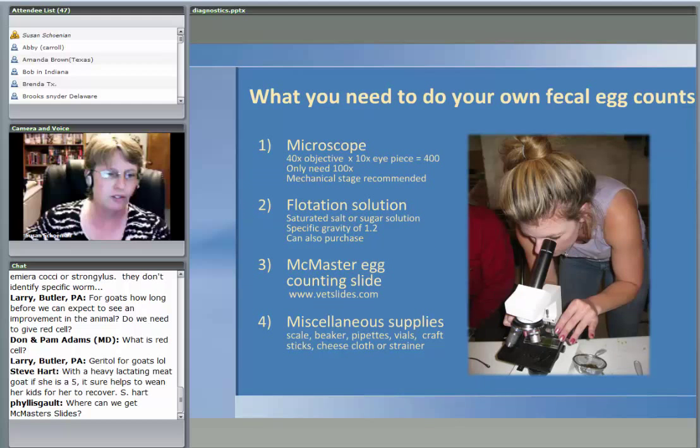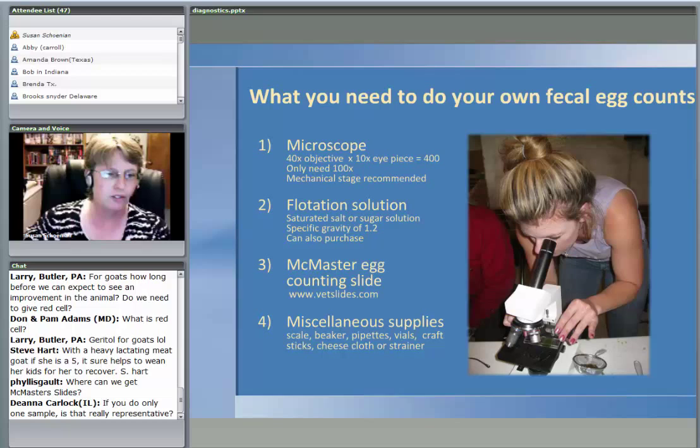So what do you need if you want to do them on your own? Because fecal egg counts, they're both a farm test and a lab test. You can send them off and let somebody else do them. We do that for our goat tests. I don't do fecals, I send them away. But you can do them yourself. Here are just the basic things you need to do them. We've taught classes on them. Langston University, where Steve is from, has taught classes on them. You can see some tutorials on the web.